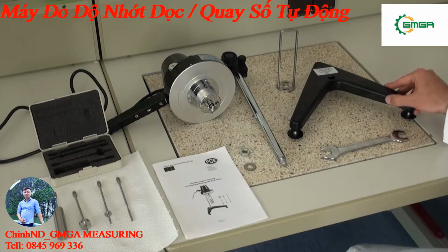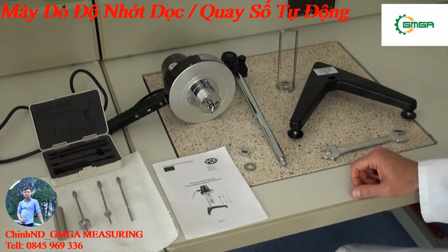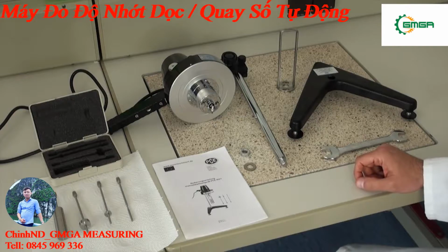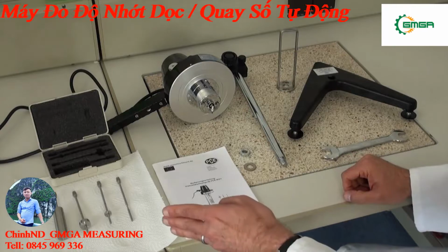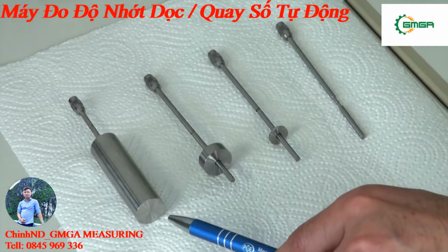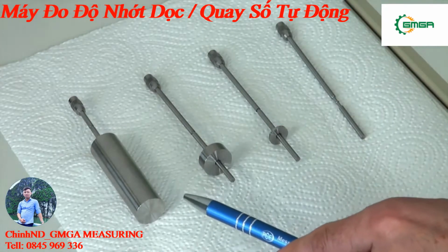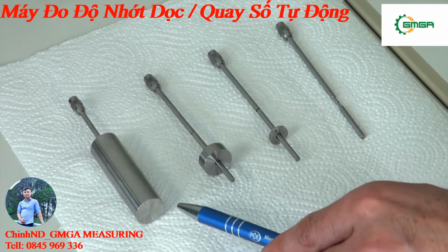Table stand, the support rod with the corresponding tools to fit together, a cage for the rotation body, a protection cage, the rotation viscometer, and 4 different rotation bodies in cylinder form, and a user manual. The rotation body number 1 is the lattice rotation body and is used for the lowest viscosity. It covers a measuring area of up to 1000 millipascal seconds.